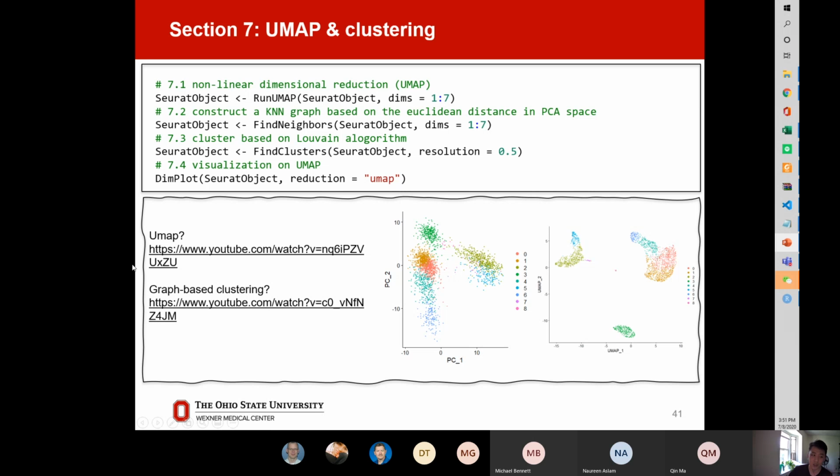Maybe you need to watch this video several times and also search other online materials so that you can understand what UMAP is. But the Seurat package is really well designed because you only run this simple command to accomplish and achieve the goal of reducing the dimension. And by using these 3 commands and plotting those results, you can get the final result here, like this.